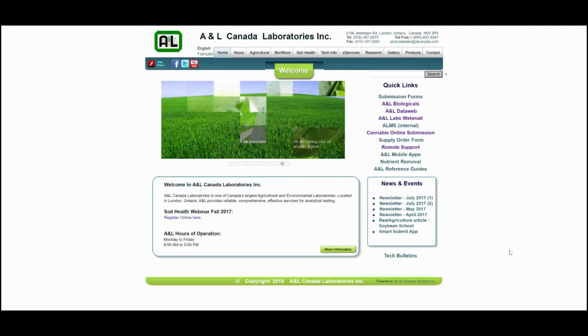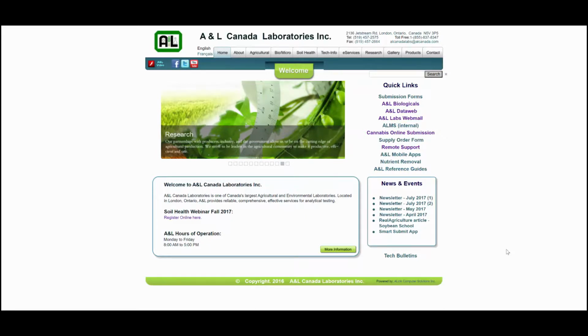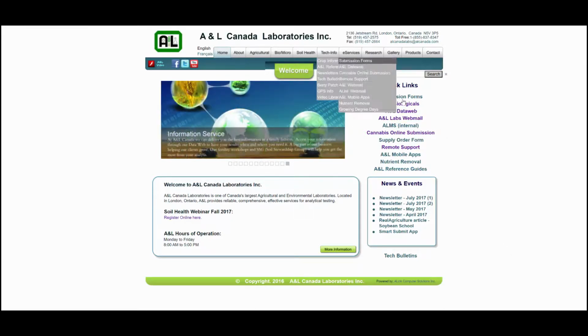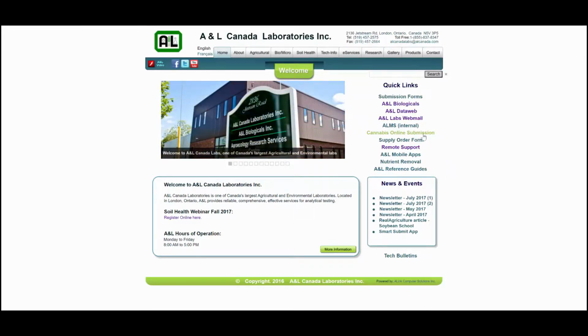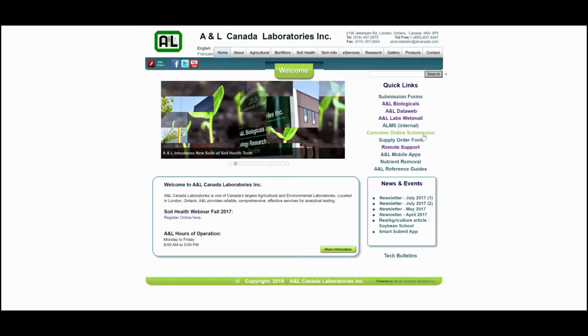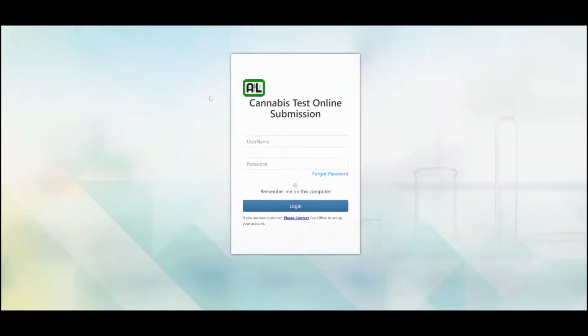I'm going to talk to you today about our Cannabis Online Submission Module. We can access that from our website, alcanada.com. Along the right-hand side under Quick Links, you'll see this right here, Cannabis Online Submission. So we click on that, and we'll be brought to a login screen here.